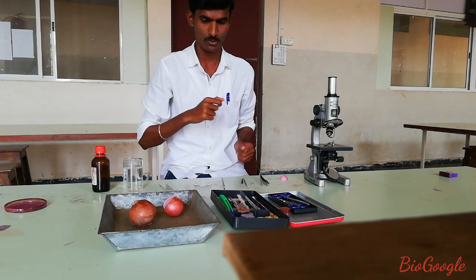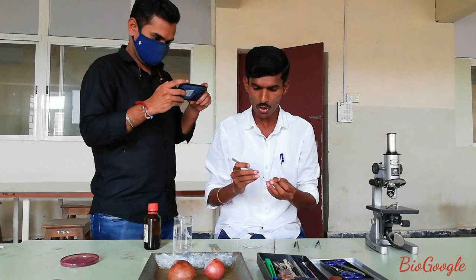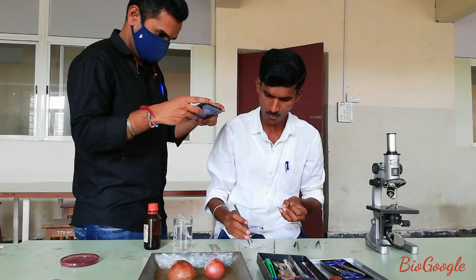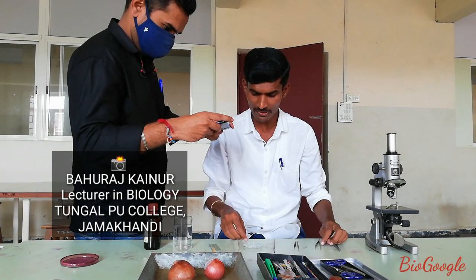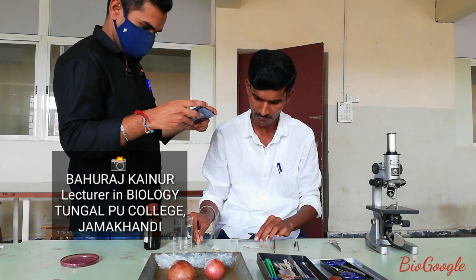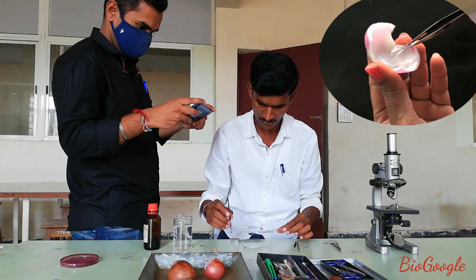Now I start the experiment. Let us take a small piece of onion bulb and peel the skin of the onion bulb with the help of forceps, and put immediately this layer in the watch glass containing water. Because of this water, it prevents the peel from getting dry or folding. Then this small piece of onion peel will be transferred onto the slide.